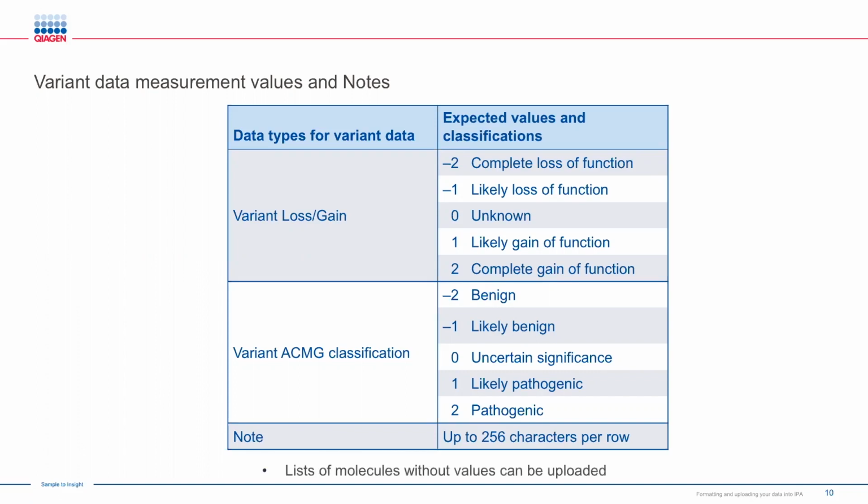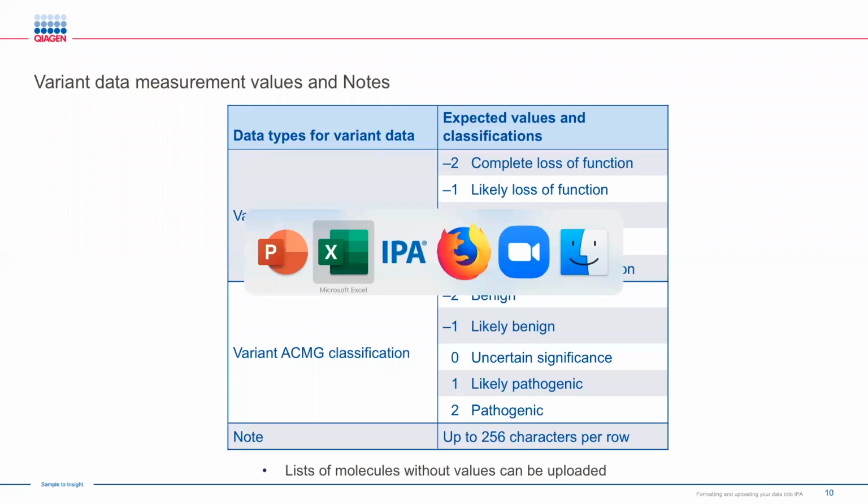And the answer is you absolutely can just upload those molecules without any values whatsoever. You just won't be able to get information like the z-scores to measure predictions of activation or inhibition. Okay, so let's go back now to finish up the formatting portion of the webinar.